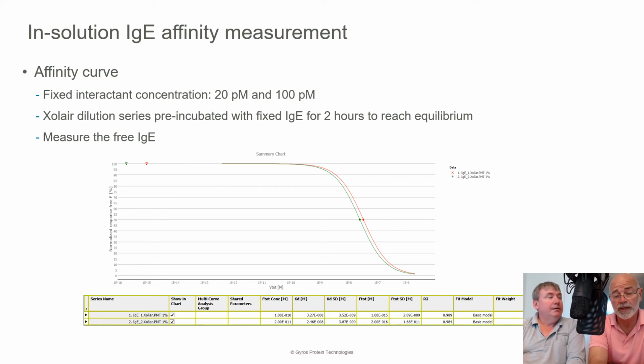Yeah, I think that's the other point, and we'll bring it out later. But many folks who are inexperienced, as I was when I first started doing affinity on the Gyrolab system, are concerned that they're seeing pretty different numbers sometimes between runs or between different methods. And it's important to remember that with affinity, as long as you're within the same ballpark, not the same exact space, it's a different measurement.